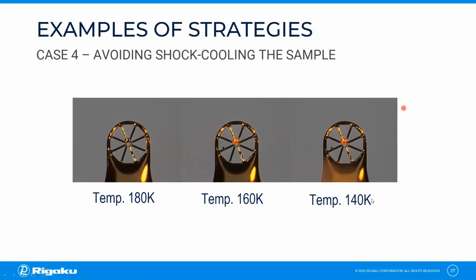So do you think that it's not often happening? But it's happening. For example, this is the case where the crystals were looking nice under the microscope, but every time I was putting them under the cryo, they were changing and basically dissolving. And I quickly did this kind of case where I cool down the cryo and check for the quality, just basically a single file scan. And I realized that at 180 kelvins, the crystal is okay.